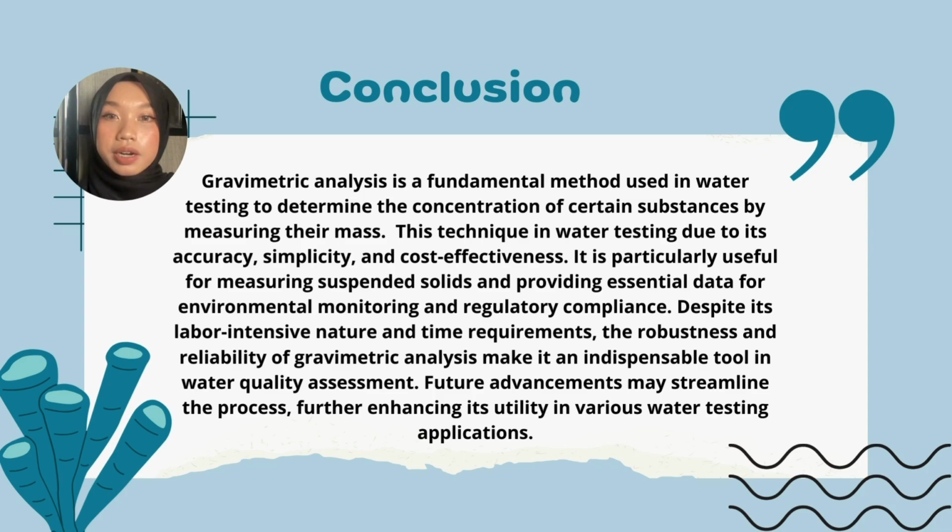Despite its labor-intensive nature and time requirement, the robustness and reliability of gravimetric analysis make it an indispensable tool in water quality assessment. Future advancements may streamline the process, further enhancing its utility in various water testing applications.